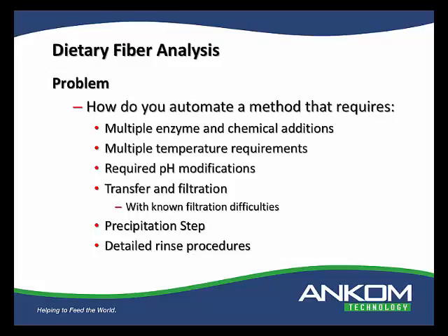There's 3 different enzyme steps, 2 different temperature requirements, a pH change. Then you have to transfer and filter the sample. If you're doing insoluble and soluble, if you're trying to get both of those fractions, you have 2 filtrations. If you're doing a total dietary fiber, you're talking about a digestion followed by a precipitation and then a filtration. So all these steps that require manual manipulation, how do you automate them?